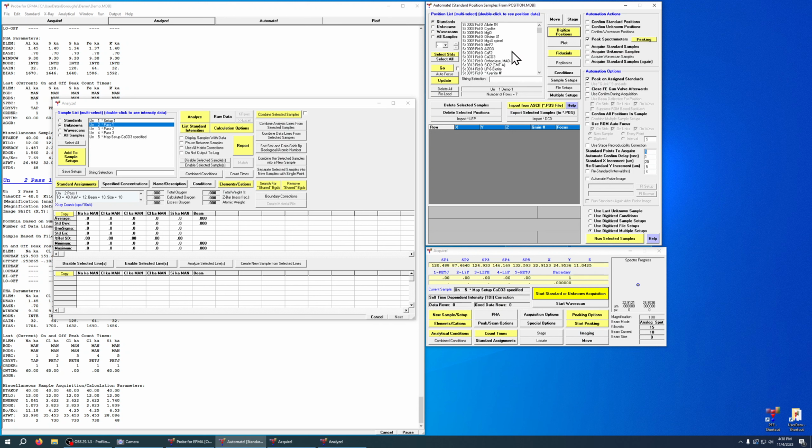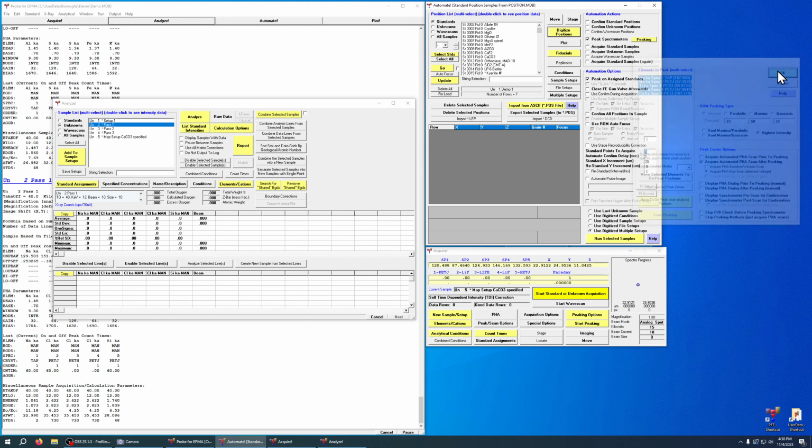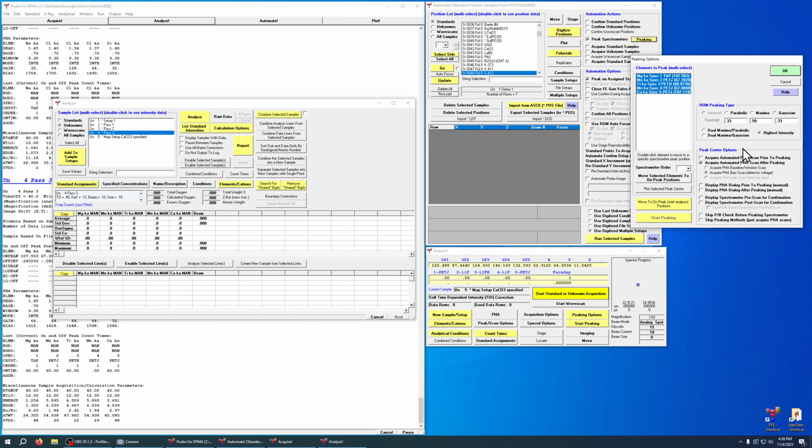And now in this case, it was magnesium, manganese, titanium, so that's pass 3. So down here I can look and see my magnesium, manganese, titanium, etc. and I can choose these standards. So now I just have to select these standards. So I need to select standard 48, standard 29, and standard 22. So I can come in here, I go find 22, 29, and 48, and I've got those selected. I've got peak spectrometer selected. Select all my elements, make any choices I want here.